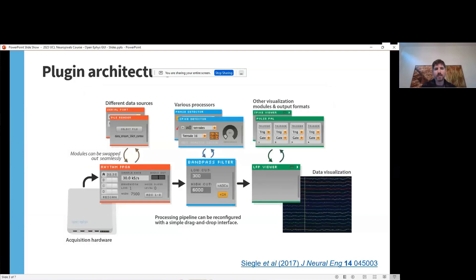The distinguishing feature of the GUI relative to other software in this domain is the plugin architecture. What this means is that all neural data is handled by plugins that are compiled separately from the main application. This makes it easy to customize your processing pipeline for different types of experiments, or to use the same data processing chain with a variety of different data sources.